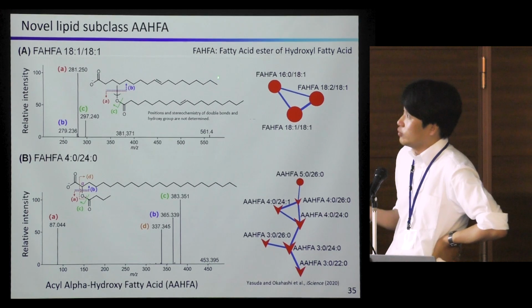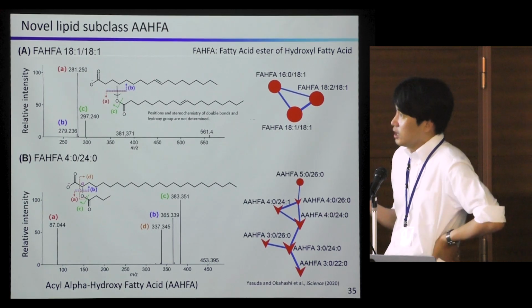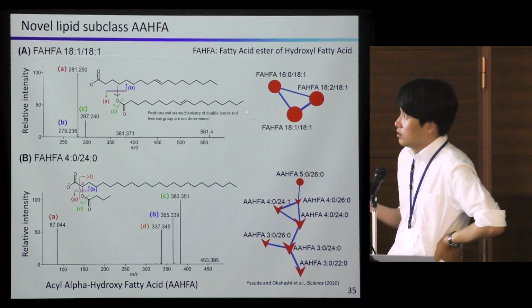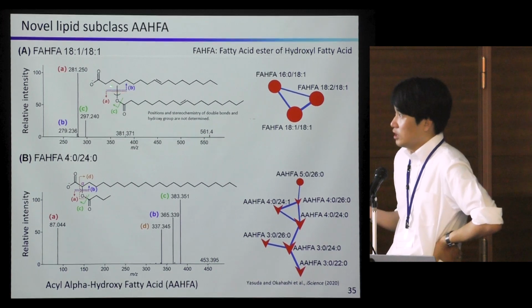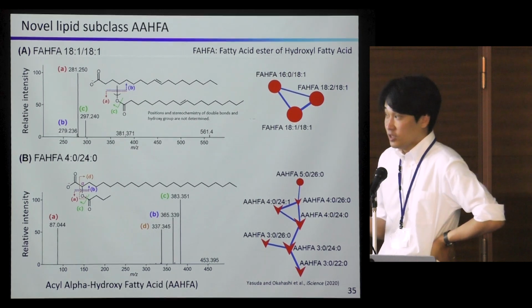FAHFA is the abbreviation of fatty acid ester of hydroxy fatty acid, like a fatty acid linked to a hydroxy fatty acid. We cannot predict the hydroxylation position correctly, but the combination of the fatty acids is long-chain, like this. And this doesn't show the bacterial dependence.